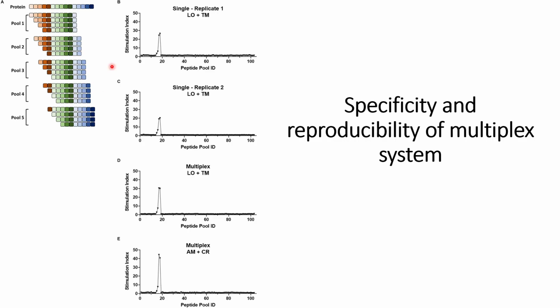Thereafter, since these pre-pro insulin peptides can be used to trigger the 1E6 T cell receptor, they used the 1E6 T cell receptor system in these experiments. First they checked the single fluorescence 8XNFAT reporters, and they saw that the peptides from 12 to 24 show the highest stimulation index.